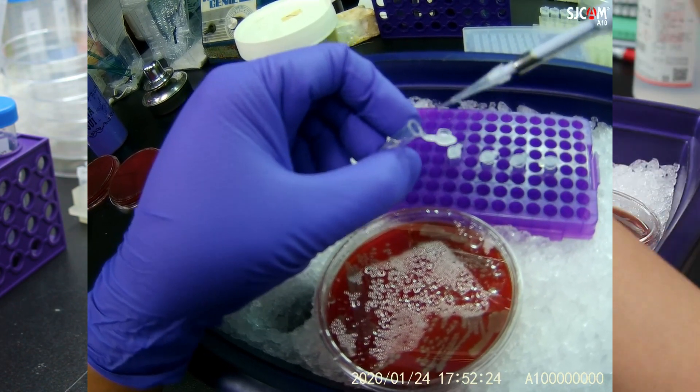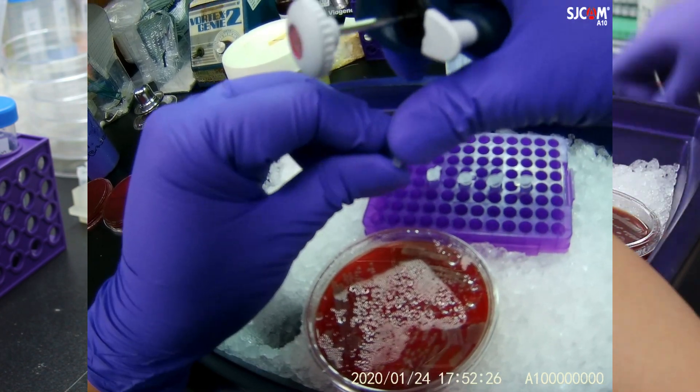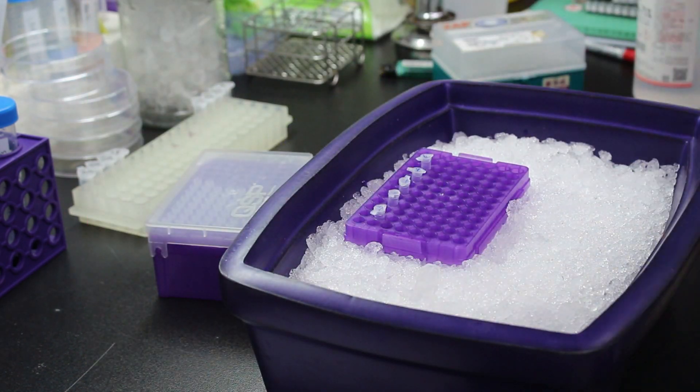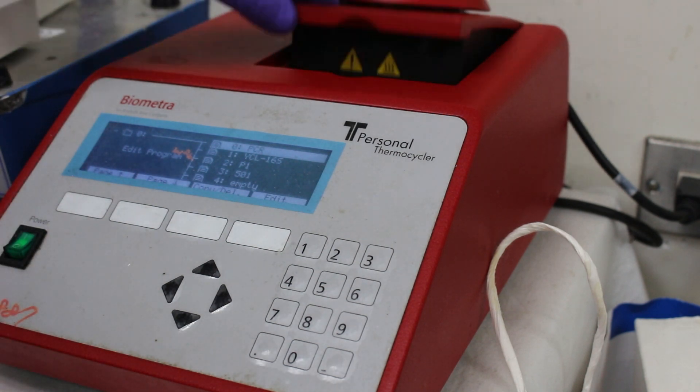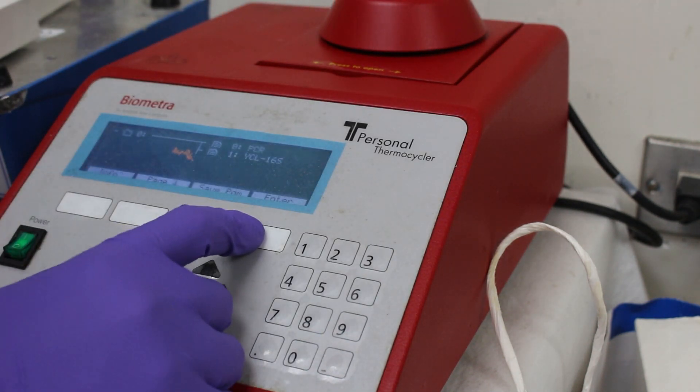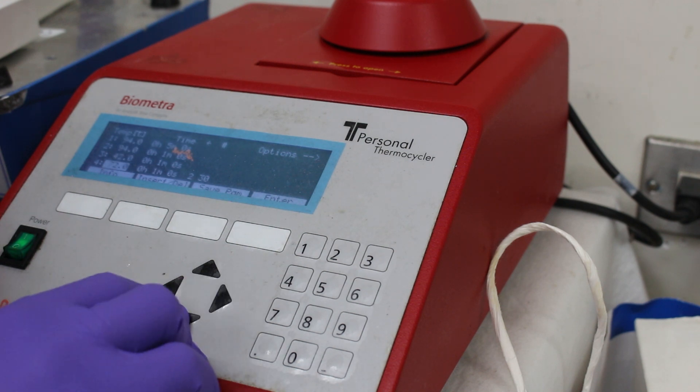Do not use too much bacteria. It will interfere the PCR process. After all the ingredient has been mixed thoroughly, put the PCR tube into PCR machine and proceed as standard PCR.